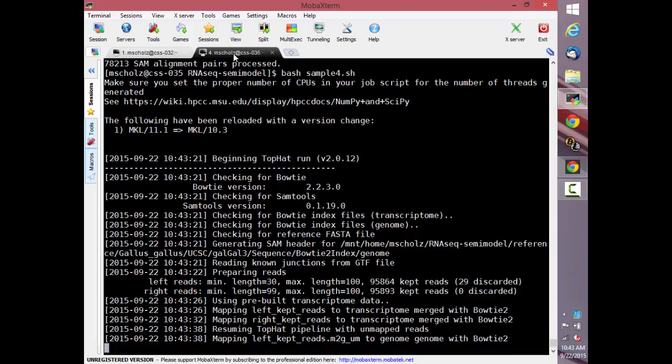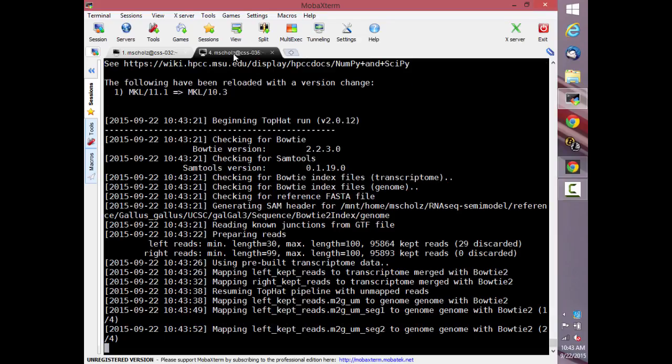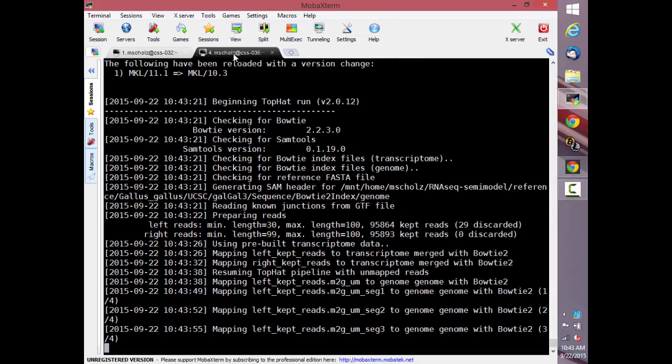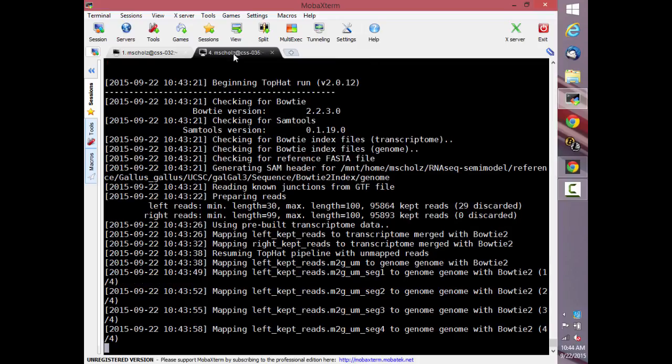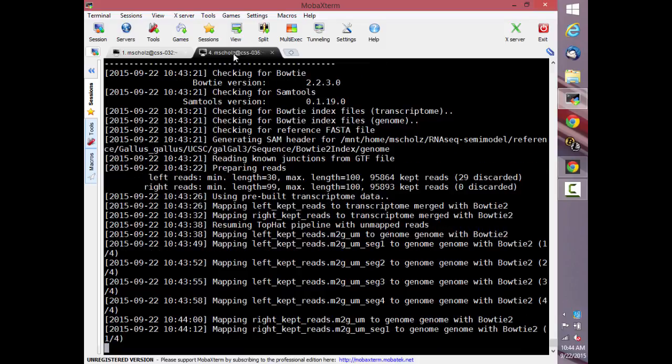That part I can show you what we can do with today in terms of we can transfer those annotations over and get some useful bits. The part that's going to be a little bit more difficult to show today is what you do with the new annotations, genes that didn't exist already that you need to figure out what they are before you can get any useful information. The biggest statement in that is that there are lots of ways you can annotate the genes.